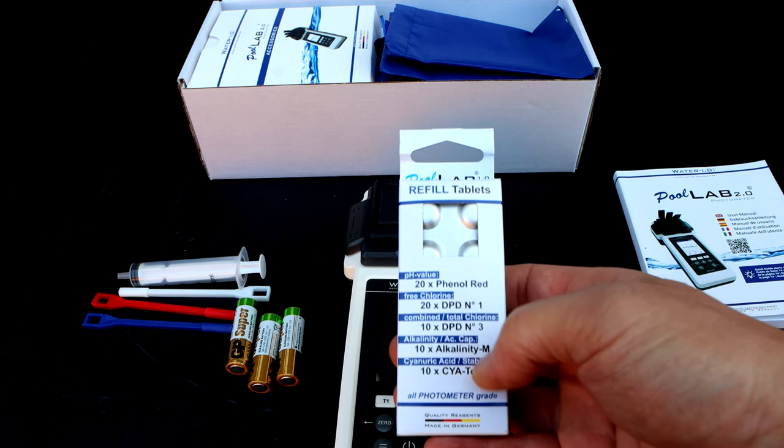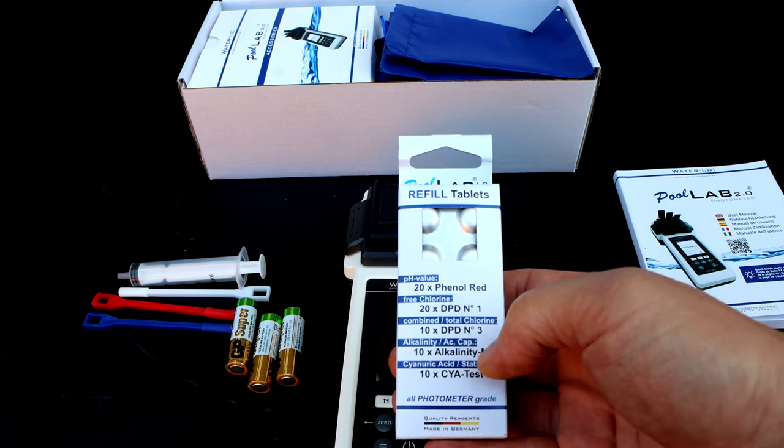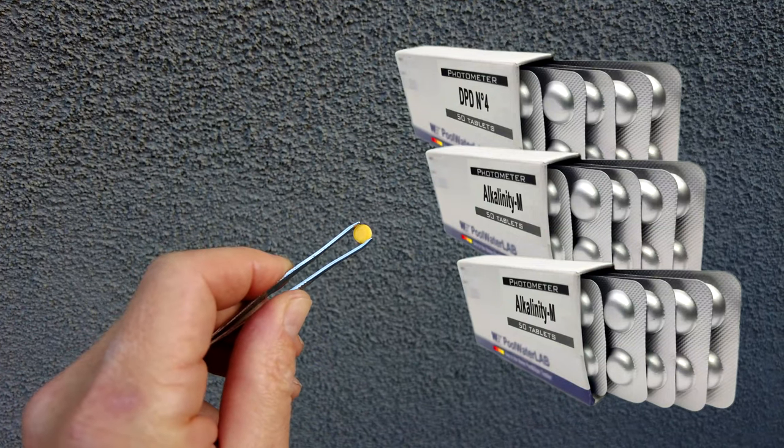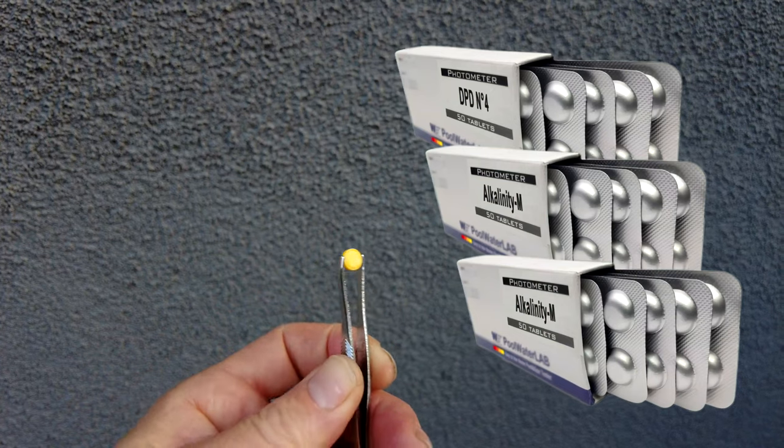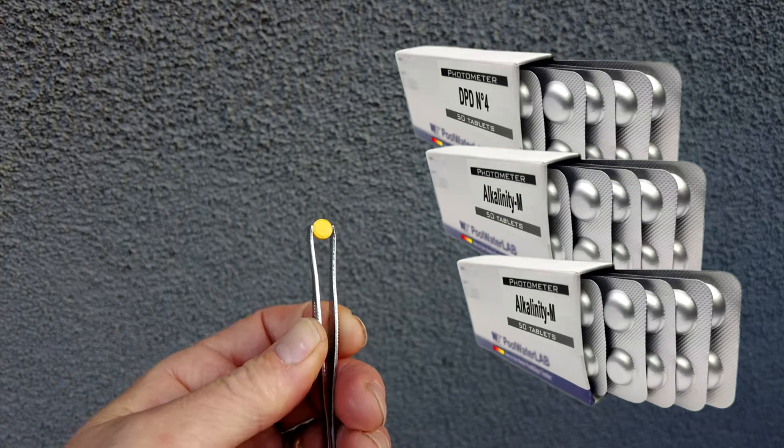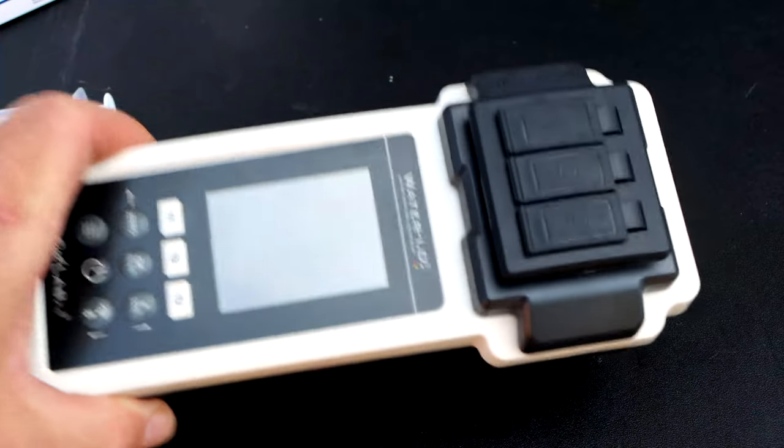The included tablets test for pH, free chlorine, combined chlorine, alkalinity, and cyanuric acid. Most test factors use this tablet which has pre-measured reagent in it, making it one of the most accurate ways to test your pool water.